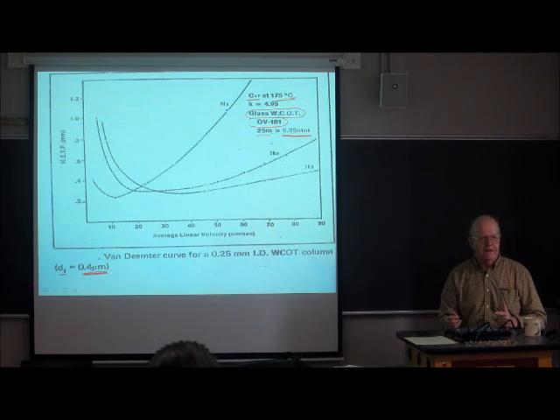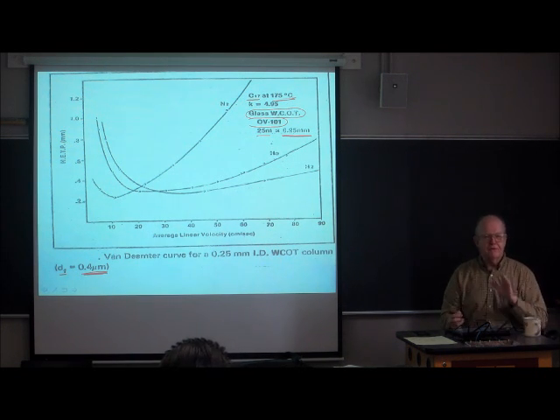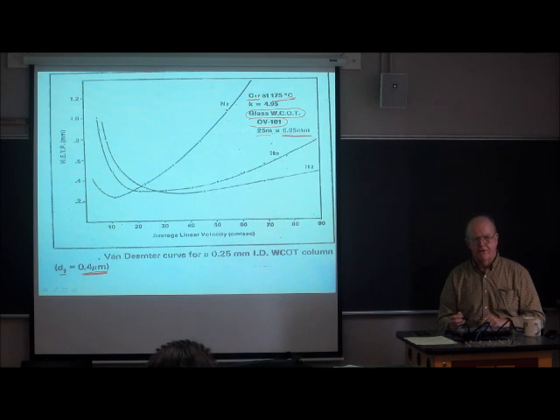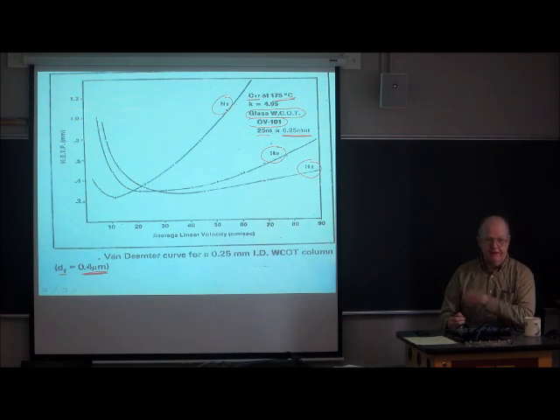Therefore, the nature of the gas cannot possibly influence retention. So all three of these curves correspond to the same retention factor. But we see big differences between the curves. This is the nitrogen curve as the carrier gas, the helium curve, and the hydrogen curve.